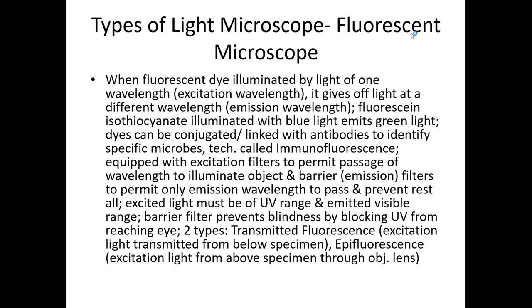Fine. So we will go to the third type of light microscope now, that is the fluorescent microscope. From the name itself, you know what this microscope is all about: fluorescence. We have studied the phenomenon of fluorescence. So what was fluorescence? Anybody, can you please type in the comment box, what do you mean by fluorescence?